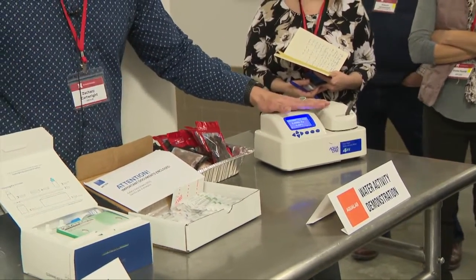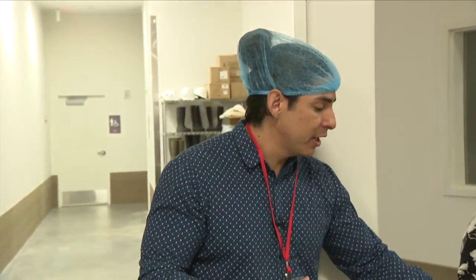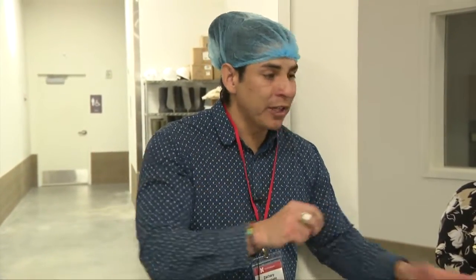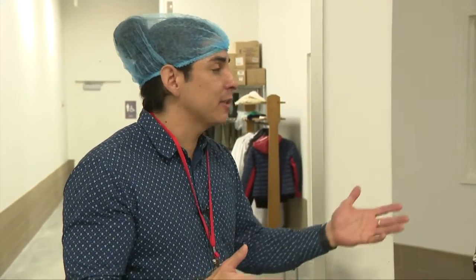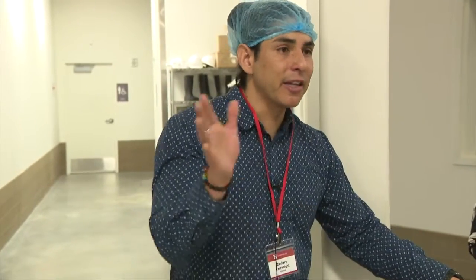Part of what was discussed earlier is wanting to digitize records. Our newer devices will actually automatically record the reading and put it in the cloud so you don't have to write anything down. The advantage of that is if an inspector comes in or if you have a problem in your facility, it's really easy to go back and look at your records and see exactly when something was out of spec.